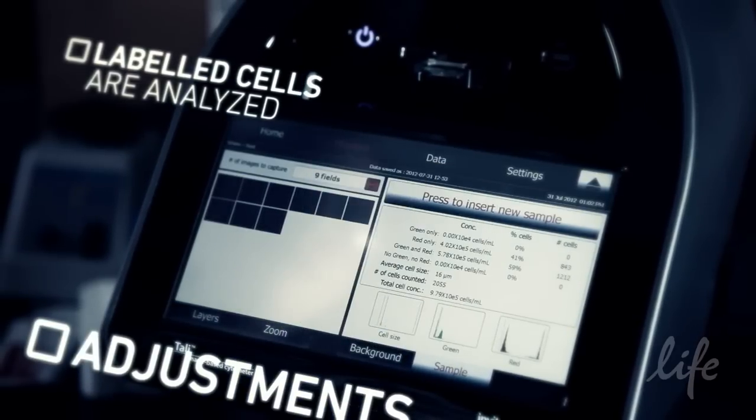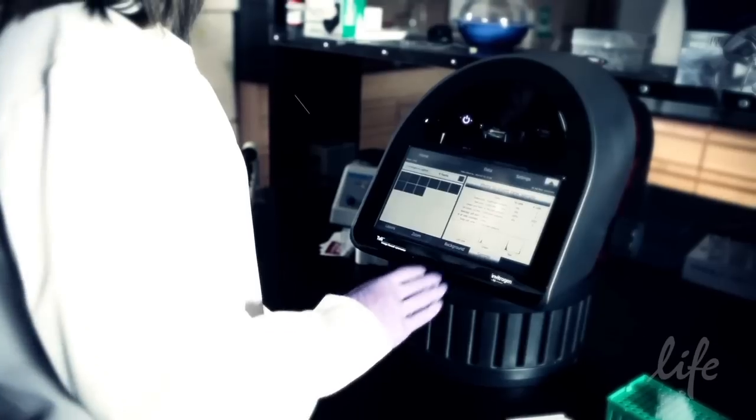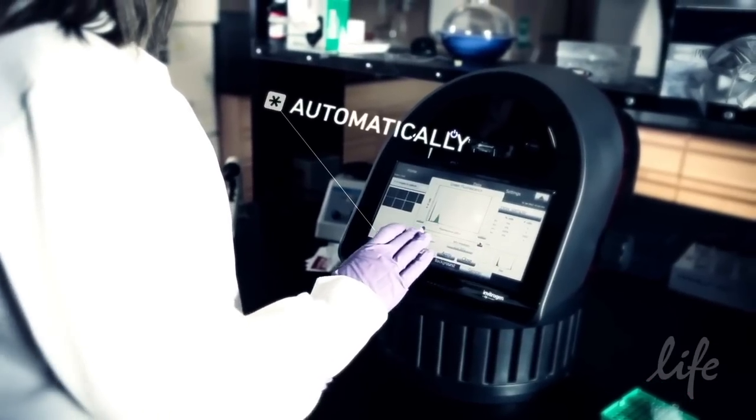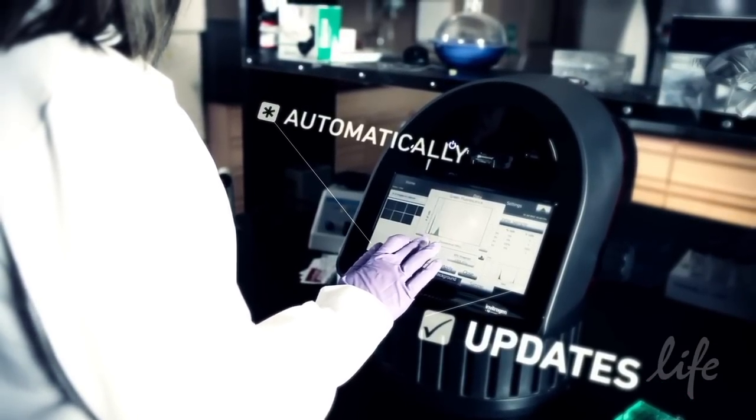Following any adjustments made to the cell size and fluorescent gates, TALI automatically re-analyzes the data and updates the results in the sample tab.